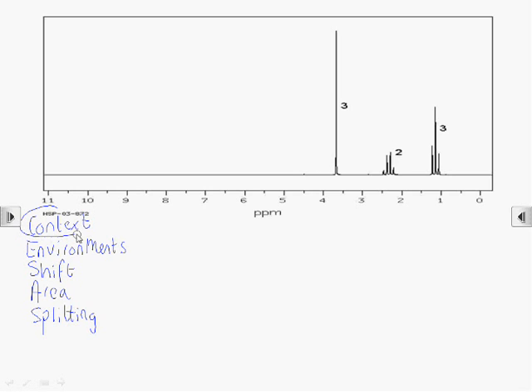We start by looking at the context. What do we know already about the molecule? In this case, the question would tell us that it's an ester.